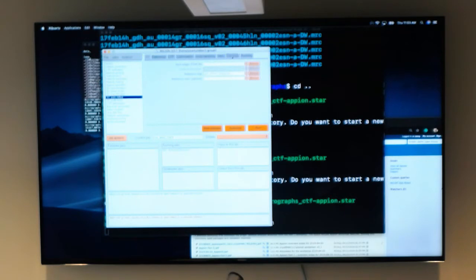Okay. So now what I really want to go into is this compute tab, where, given we have a certain amount of RAM, this instance is SSD, so it runs pretty fast. You won't have any I/O issues, so it won't be a bottleneck. But there might be occasions where you want to pre-read your images to RAM. Just note how much RAM we have, 240 gigabytes. So if you extracted your particles beyond that, then it won't be able to be used. Something you can do for speed is to skip padding.